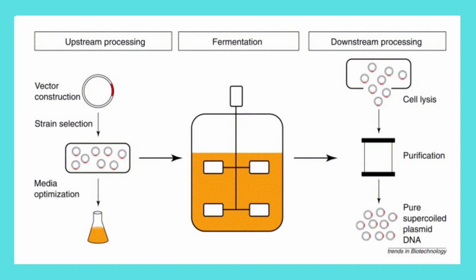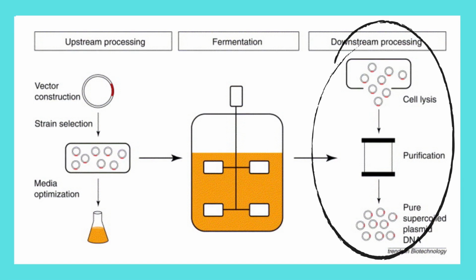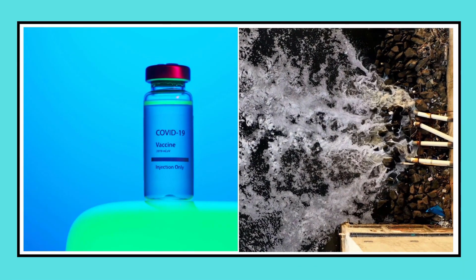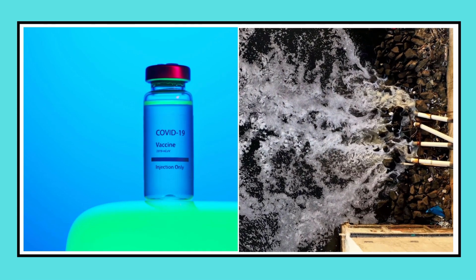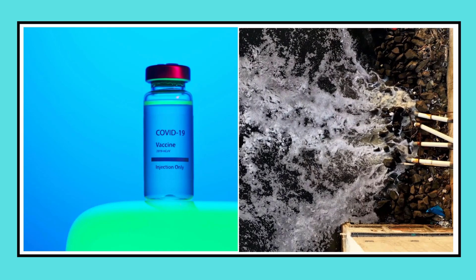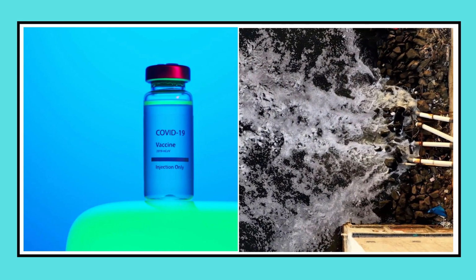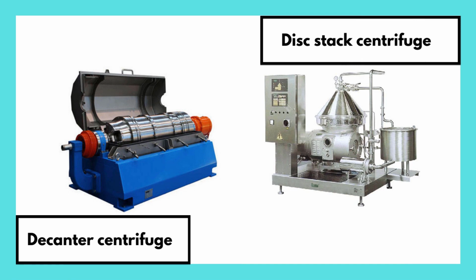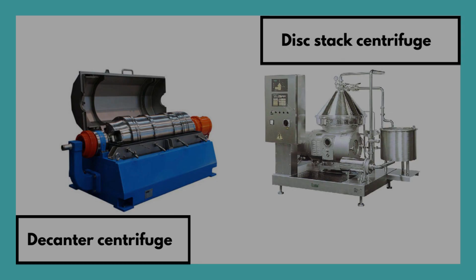In big factories, centrifugation is part of their downstream processing. It is used to recover cells and other valuable pharmaceutical reactants and products, used for sewage processing, and to isolate valuable synthetic materials. An industrial centrifuge looks way different than the ones used in the lab. Moving forward, different centrifuges work for different purposes. However, their basic working principle is applicable for all applications.